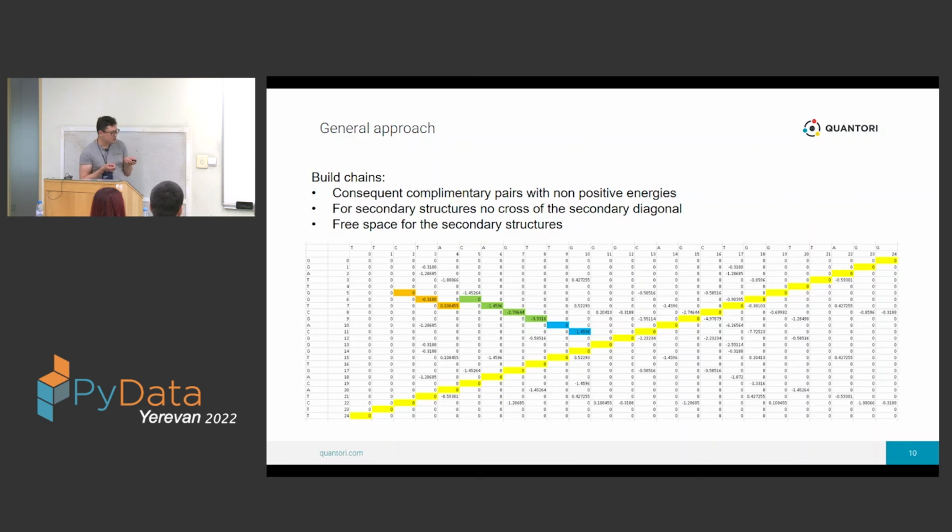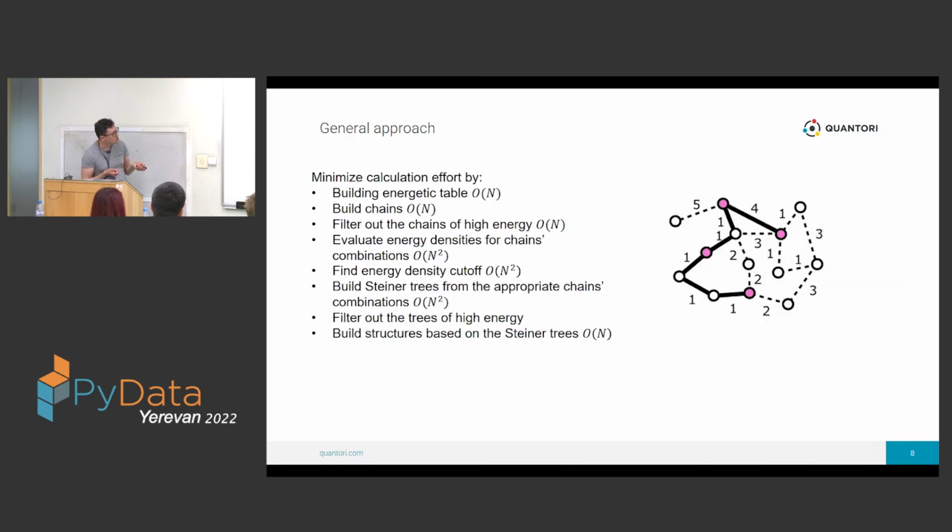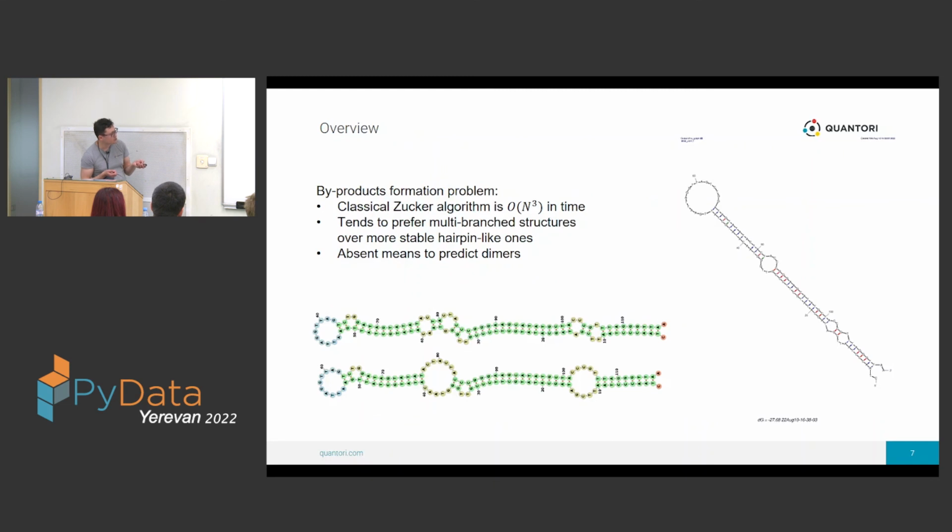But still, if we have a look at the outcomes, here is the comparison. The thing is that the greater this part of the structure, the less energy. So it's less stable in comparison to those two.